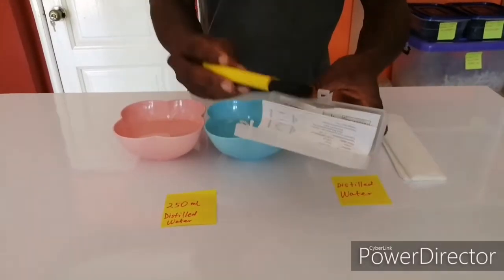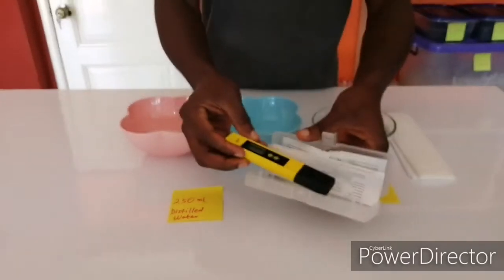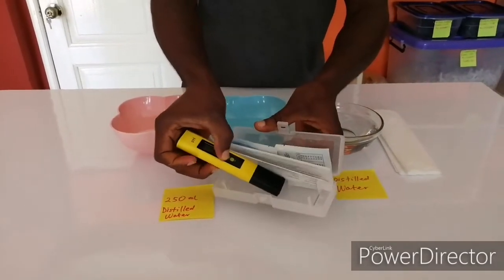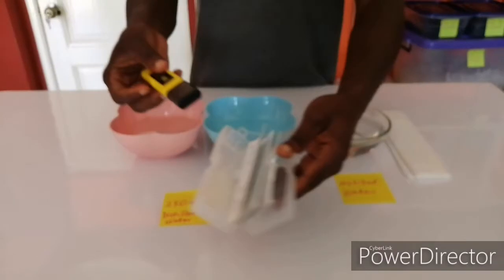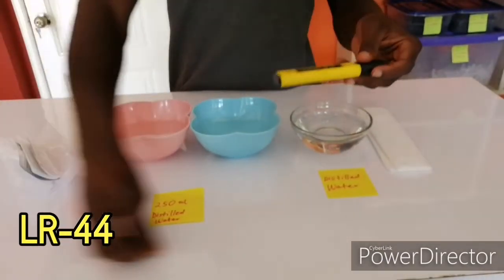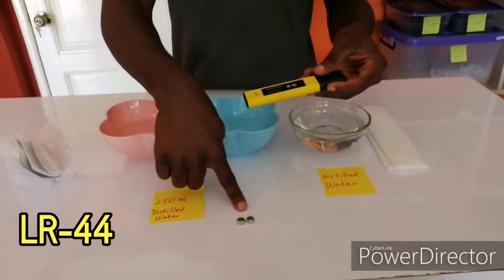One thing is when you order this, sometimes it comes with a battery, sometimes it doesn't come with a battery. So if you try to turn this on and it doesn't come on, you need to order the LR44 battery.